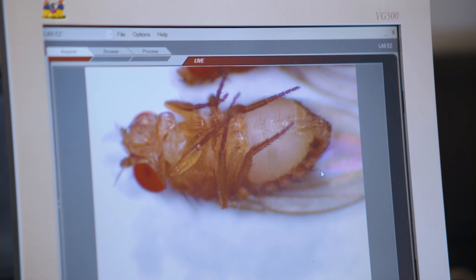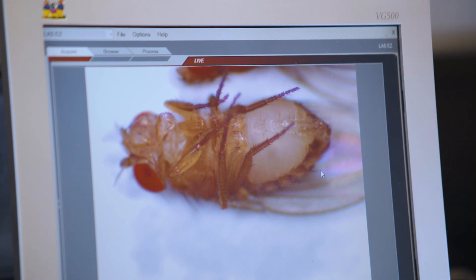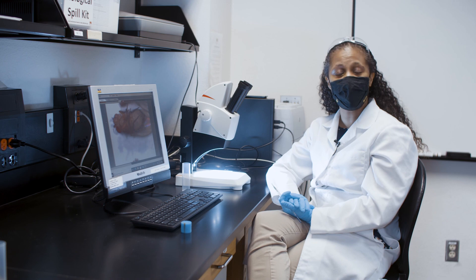One last thing I'd like to point out is how to spot a virgin female. On my card all my flies are old enough — we don't have any virgins available. But if you look at the abdomen, there are no dark splotches anywhere. If this were a virgin female you would see a nice dark, kind of greenish-gray splotch right in the center of the abdomen. This indicates a virgin — it is the remnants of the last meal she had as a larva, and you will only see it on virgin females, not on any other adult fly. Now you are ready to sex your flies and start your experiments.